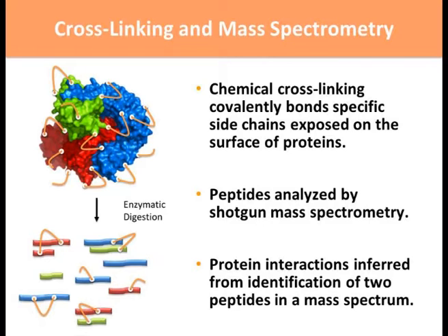You have lots of peptides being produced, and you also have cross-links on those peptides, or even just a single chemical entity. And you have to work out from the mass spectrometry information which one of these is actually being produced. And it becomes a combinatorial problem in terms of bioinformatics.